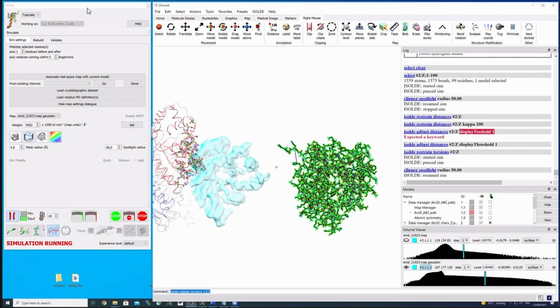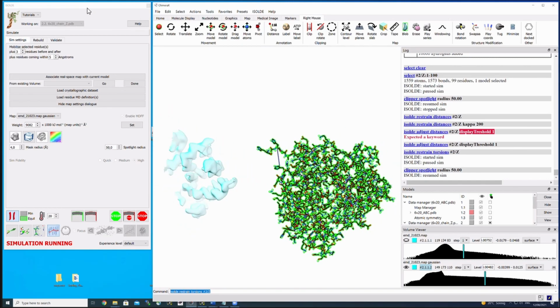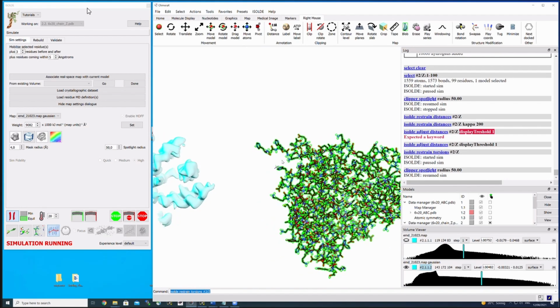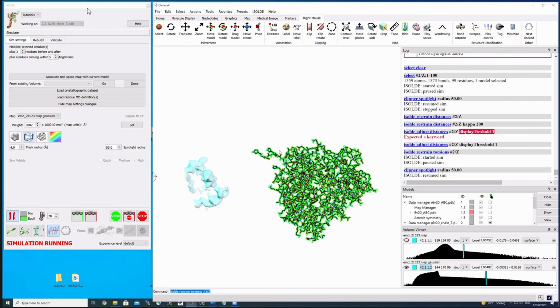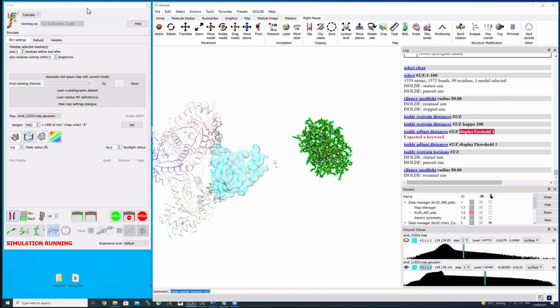You can sometimes see the torsion restraints and the distance restraints actually acting on the model here, keeping things together, although they want to really move. But the restraints are so strong that they don't allow things to fall apart. So that's very good. That's one part of the solution. Second part is we do what we've been doing before.